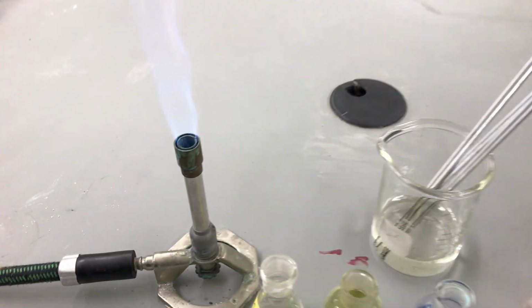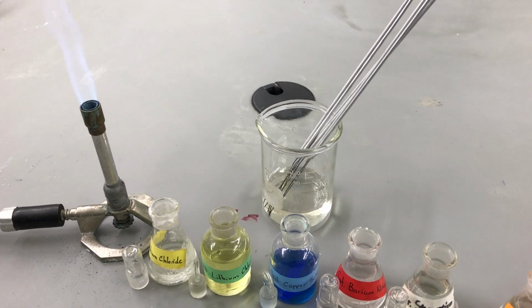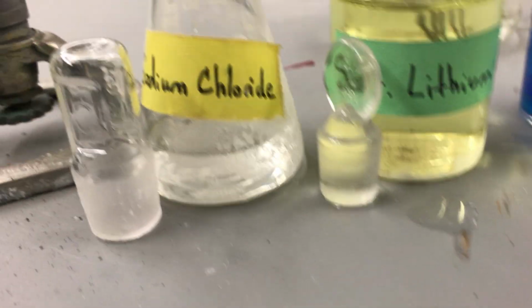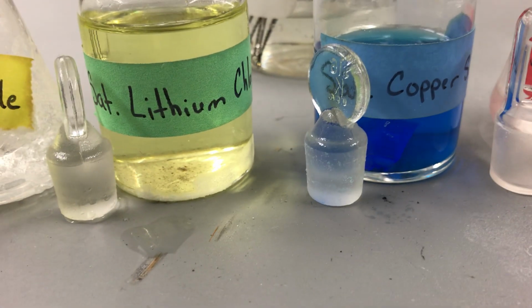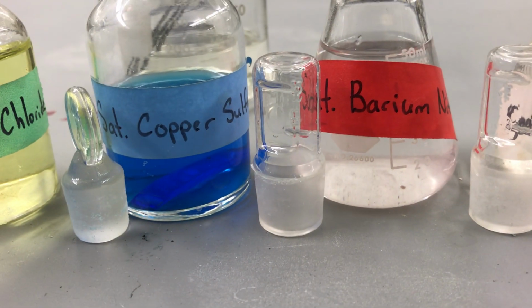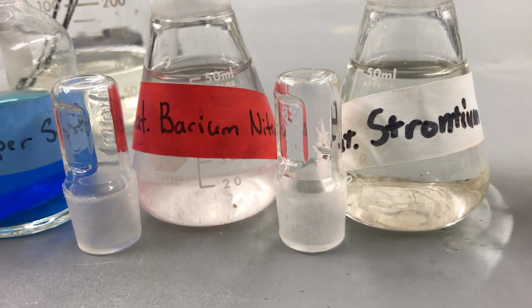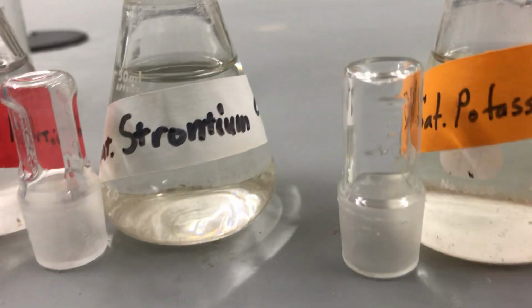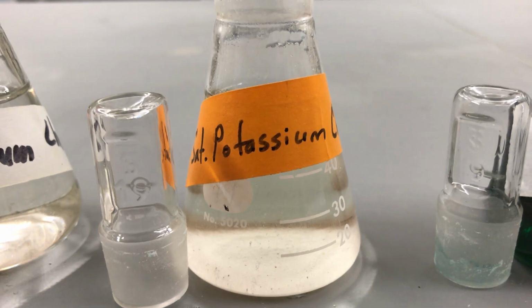All right, gang, that's our known substances. Let's take a quick break and we'll check out our unknown while you record the known substances in table 2. So once again, sodium chloride is kind of orange. Lithium chloride was a purple red. Copper sulfate was a bright green. Barium nitrate was a kind of greenish yellow. Strontium was more of an orange red, and then potassium was the lavender.